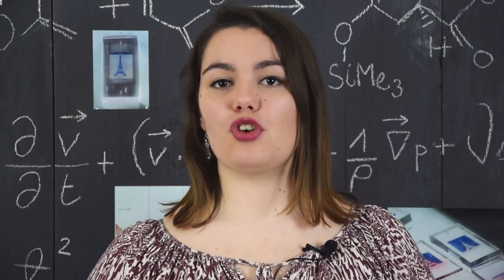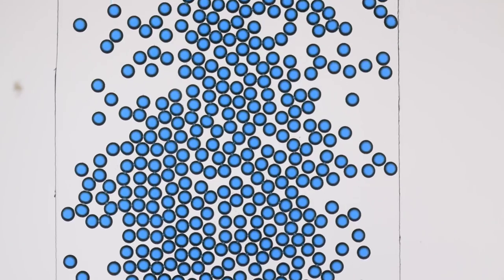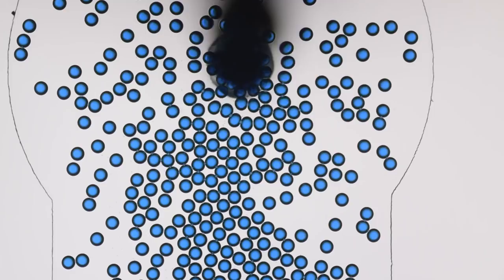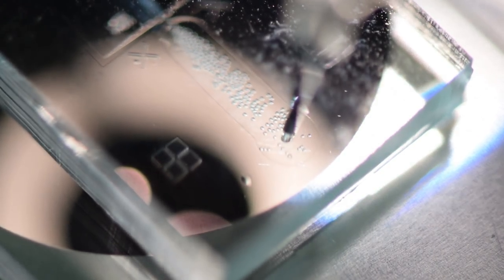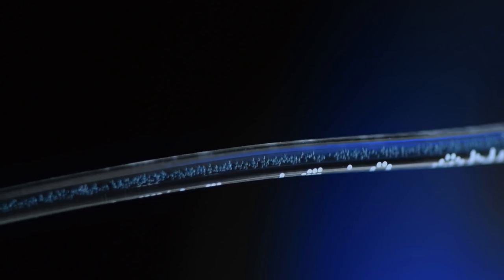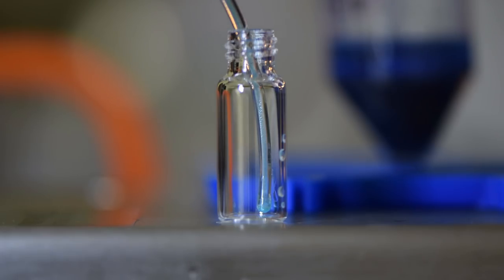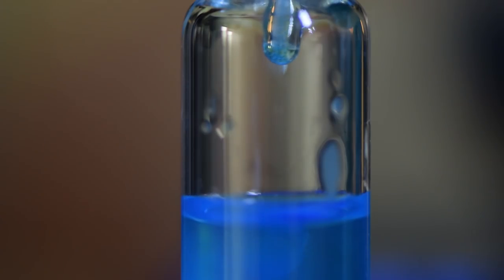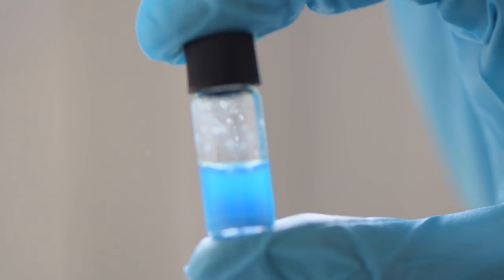Then what happens to our droplets after being created? They're going to travel in the chamber up to the chip's outlet. If we stop watching through the microscope, we can see this. And now, all that's left is to collect them in a vial. We wait an hour for the vial to fill up, drop by drop. And there we have it, we've got our micro-droplets.